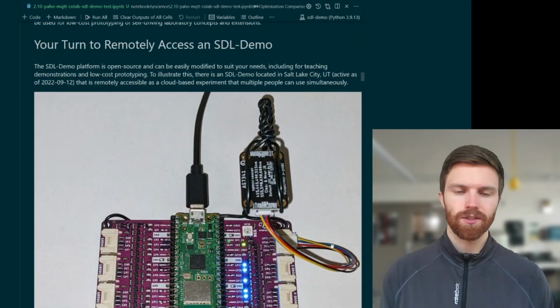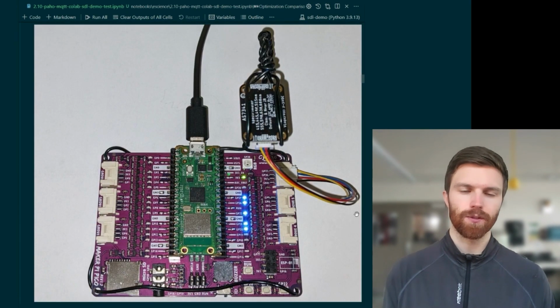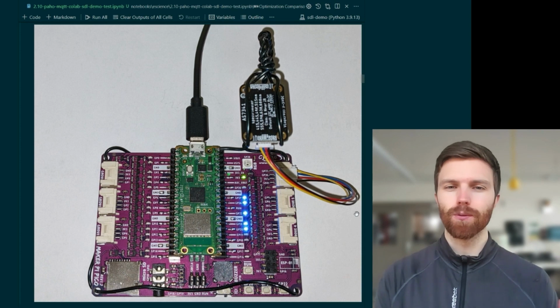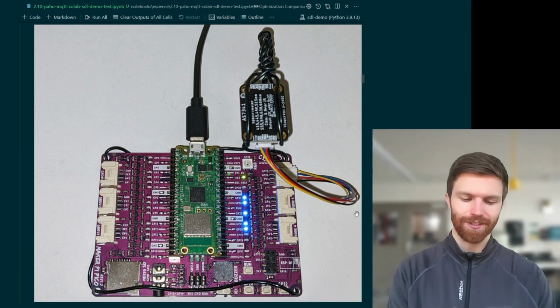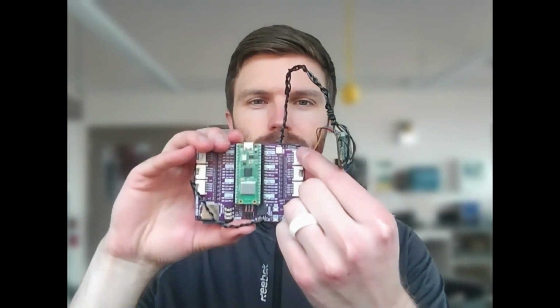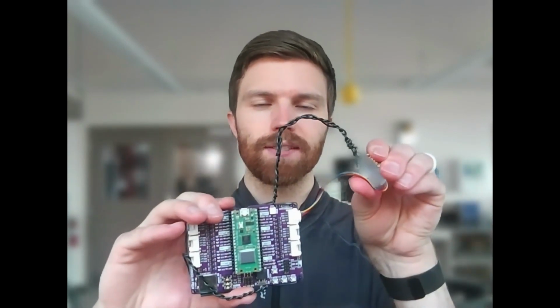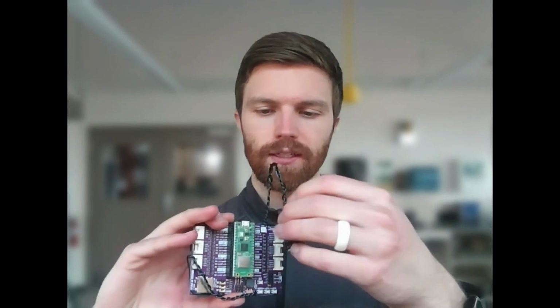And here's what the actual prototype looks like for this kind of closed loop mini spectroscopy laboratory. And I have that right here as well. One example of this being put together. Here you can see that we've got a red, green, blue set of LEDs. We have the light sensor here that gets positioned over the LEDs.